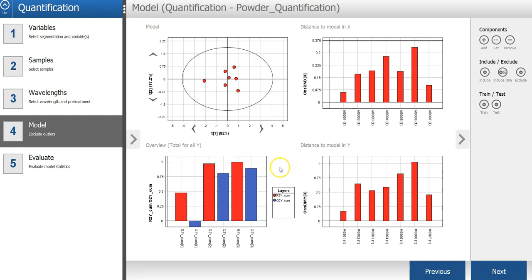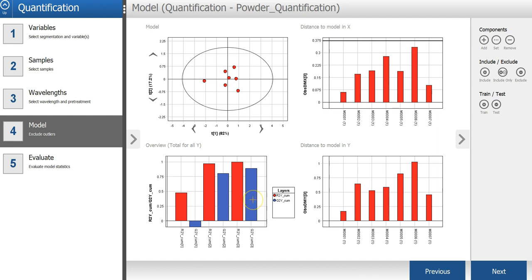A PLS quantification model has now been calculated. The overview, total for all y, is showing you how good your PLS model is. In this case, the AutoFit used three components. The red bar here, which is the R-square, shows you the model fit.